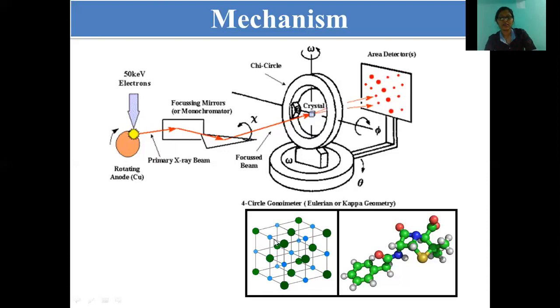When it is illuminated by the X-ray at a single time, the X-ray will only focus on and detect the atoms present in that particular cell, so the protein structure can be analyzed more accurately. In the second round of analysis, the next part of the crystal will be illuminated by the X-ray beam. Like this, the whole protein crystal will be exposed to the X-ray beam.